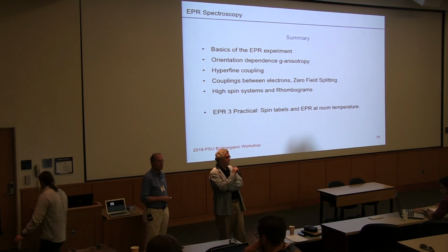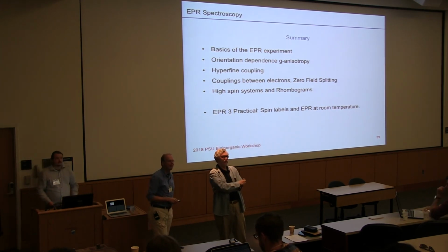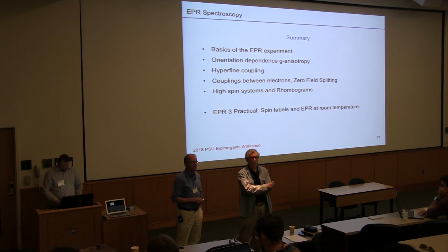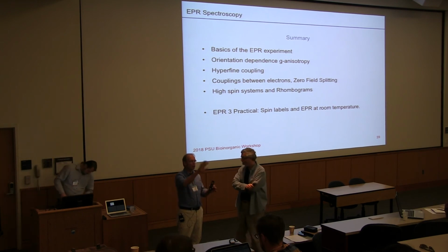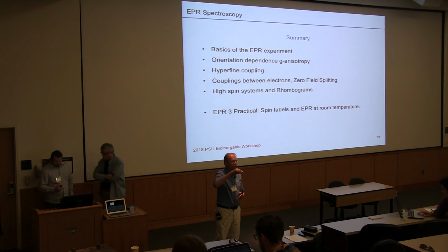Questions for Art? Up at the back, someone? You said that technically there can be lots and lots of hyperfine interactions, but usually you don't see so many, so is it just that so many cancel out? It's because the separation between them is so small, so you just get this complete forest of lines where the structure is just not visible in the spectrum.